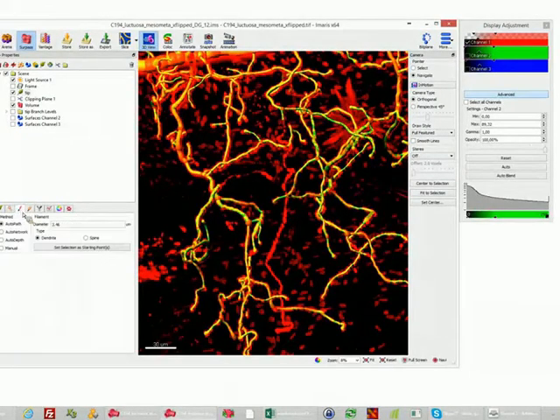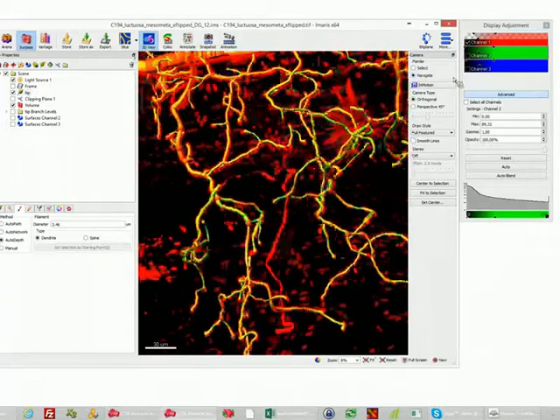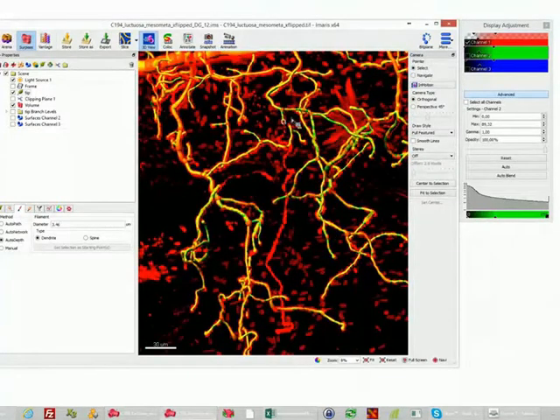For this I go to the drawing tab of the filament tool, and there we have different drawing methods. Some are more automatic, some are more manual. Because the automatic one will again take some calculation, I will just show you one which is fairly manual. This is the auto depth tool. For this, I need, again, my 3D mouse.